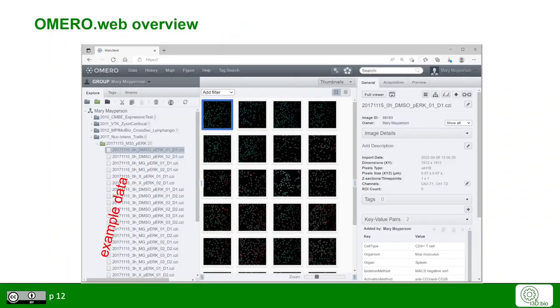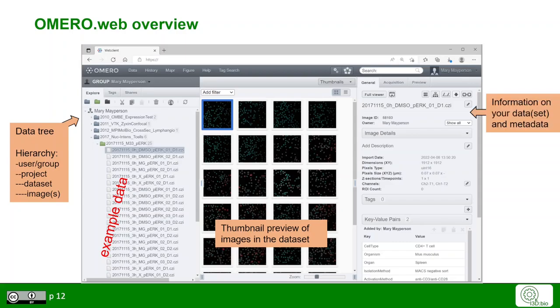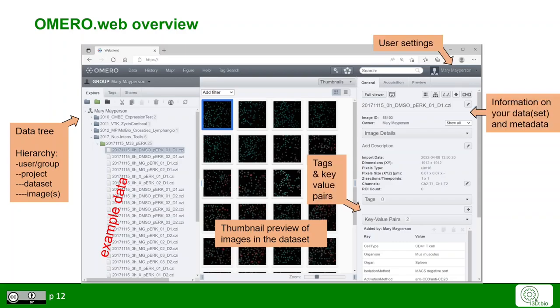As you can see, OmeroWeb, with some example data here, looks pretty much similar to Omero Insight. Again, you have the data tree hierarchy on the left hand side and the thumbnail preview in the middle. On the right hand side, you have the metadata panel and also tags and key value pairs, but also in the upper right hand corner, your access to user settings.